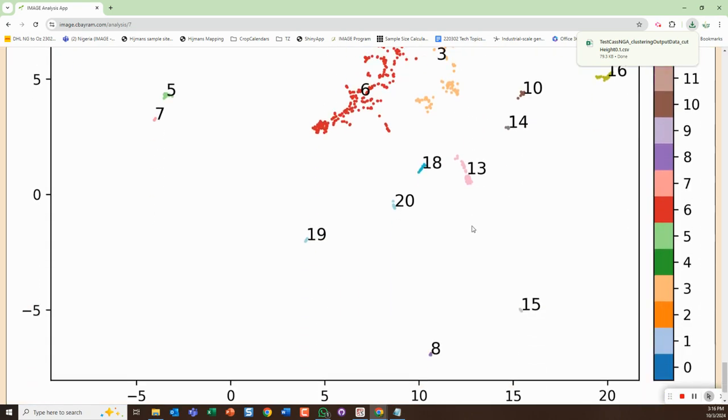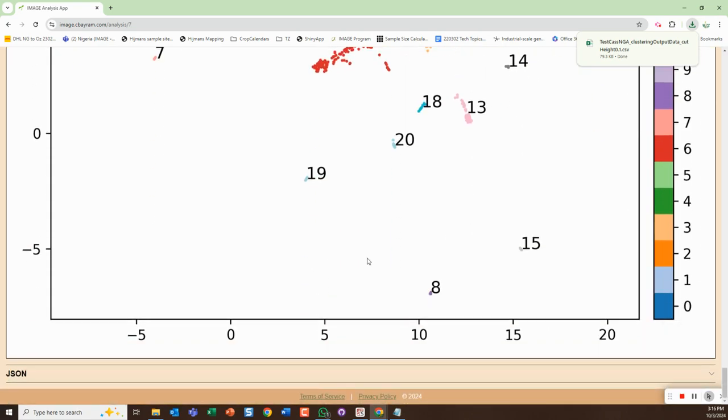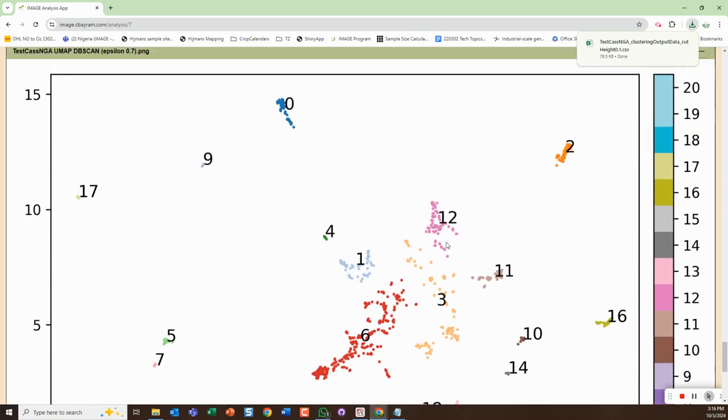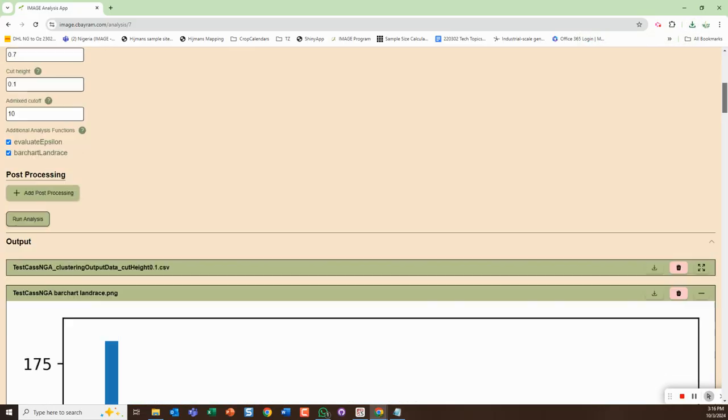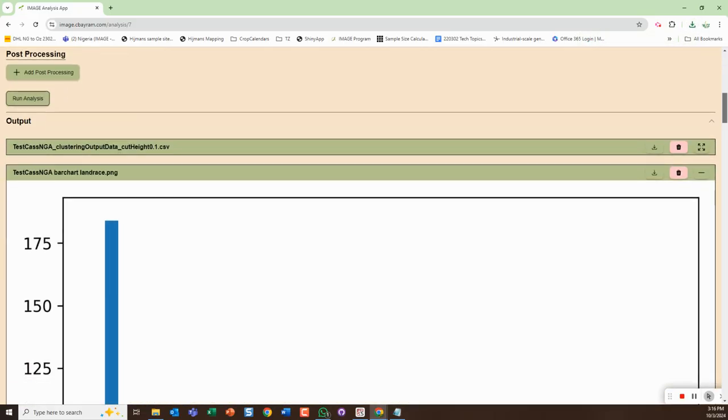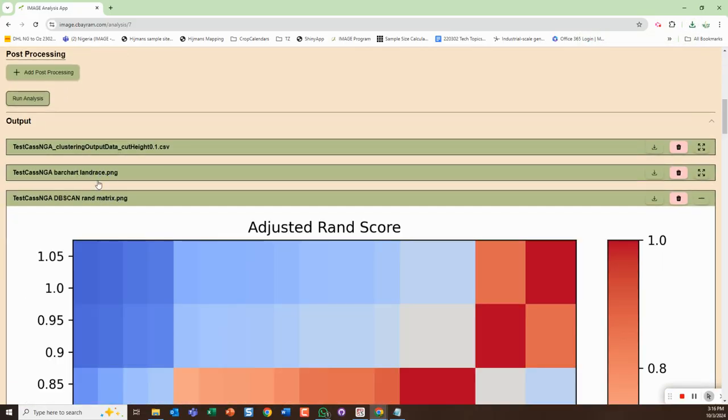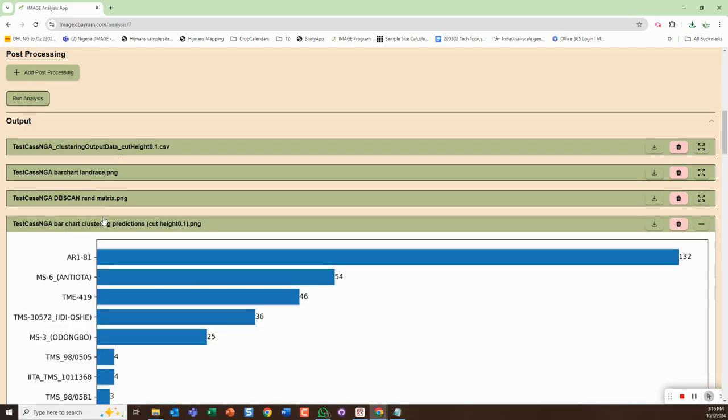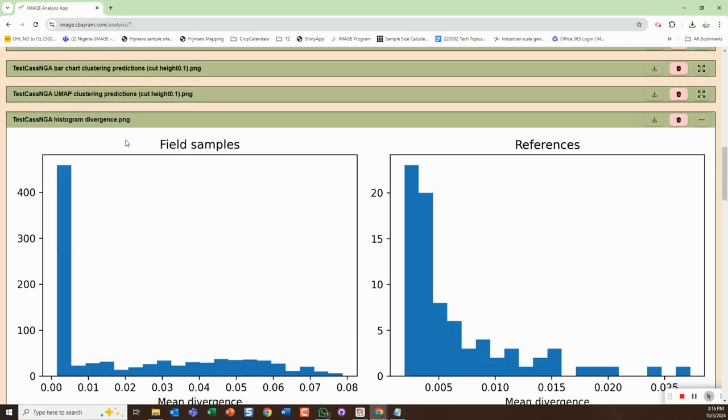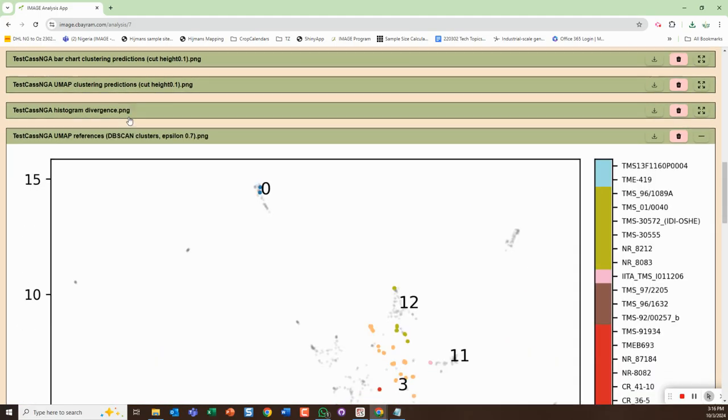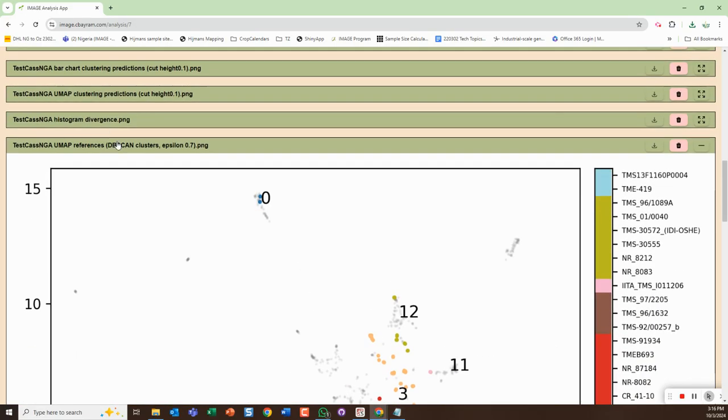Here's the divergence. Here's also another - the UMAP with references, UMAP with just the clusters. And it looks like it didn't output the horizontal land race bar chart, so we'll have to talk with Josh about that to get that to be outputted as opposed to the vertical one.